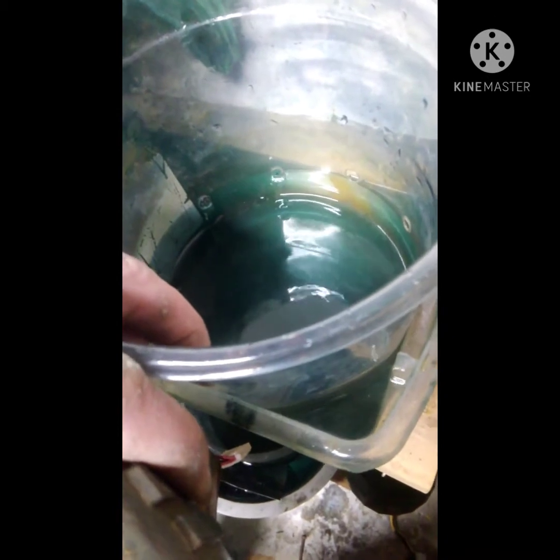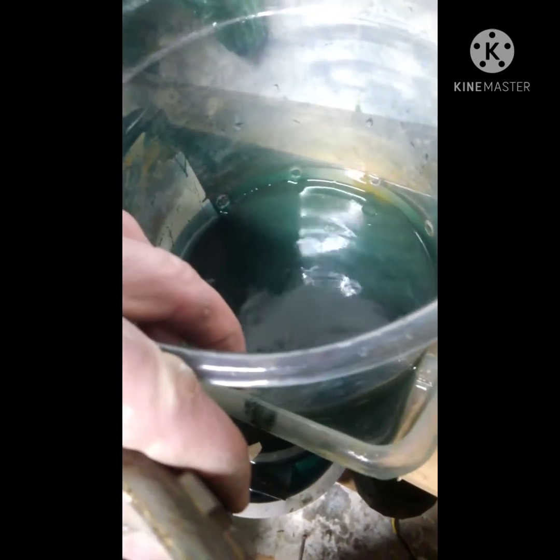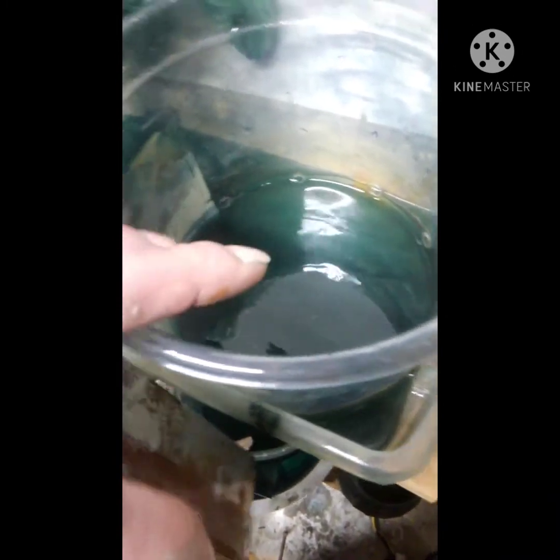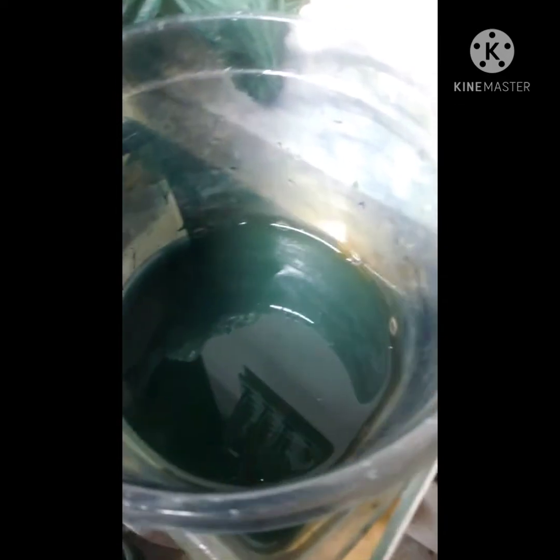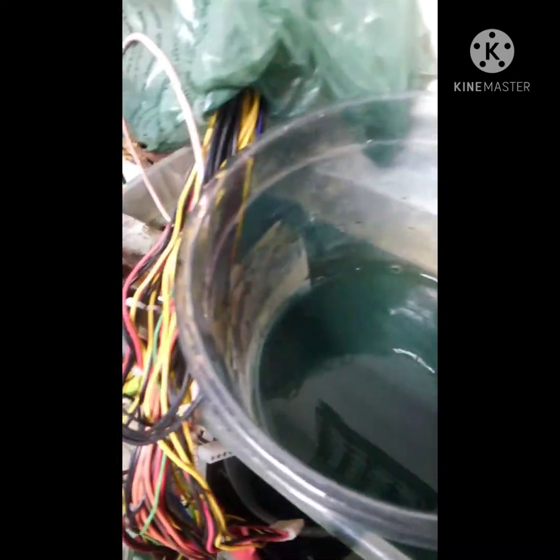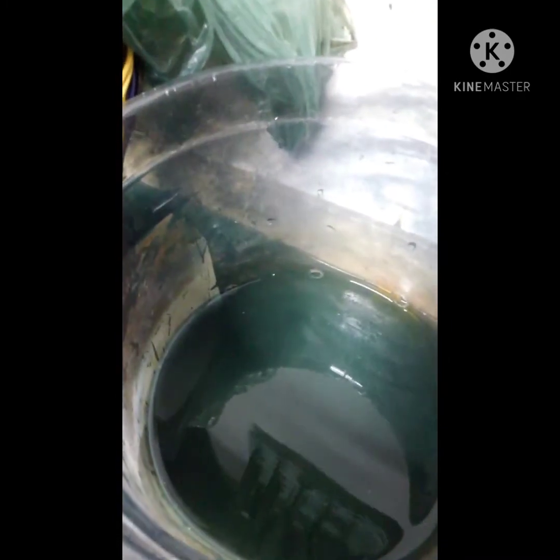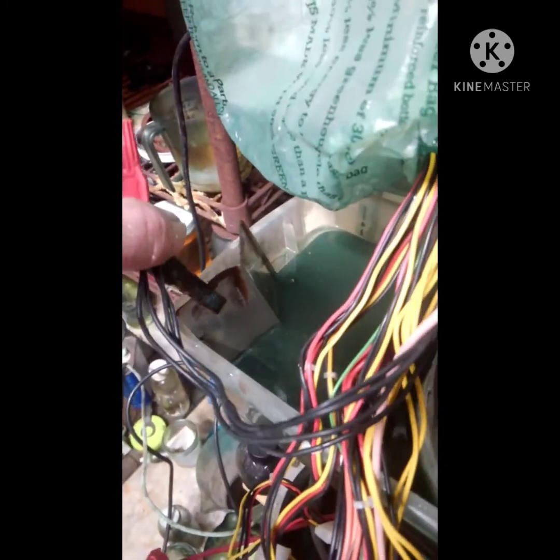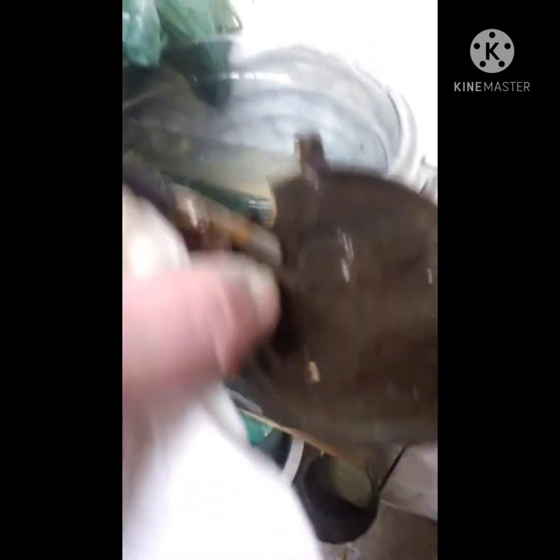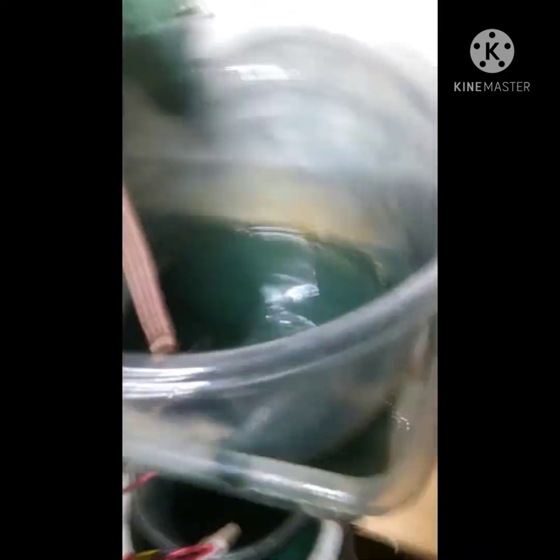This bucket that I'm sinking in will catch all the metal that's not copper from the brass, and all the copper will leave this container and come over to the other container. Now I'm going to hook up my negative electrode — I've got my negative connected to a stainless steel plate — and put it in here.